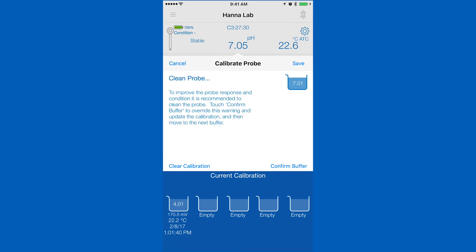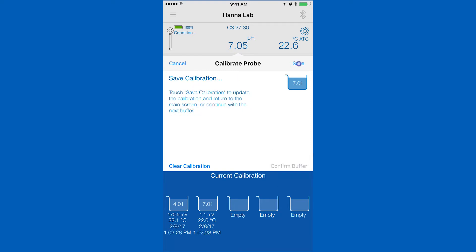After you've calibrated your desired points, hit save to return to the measurement screen. Now that you've calibrated, you are ready to begin taking measurements.